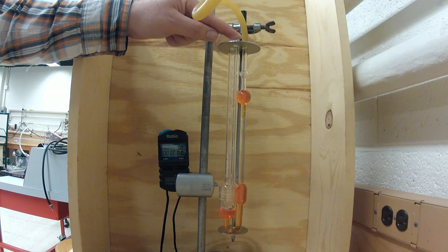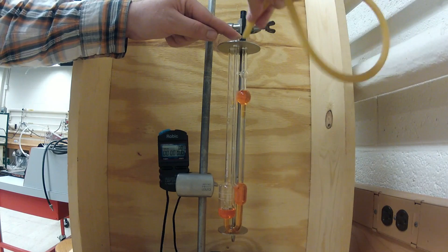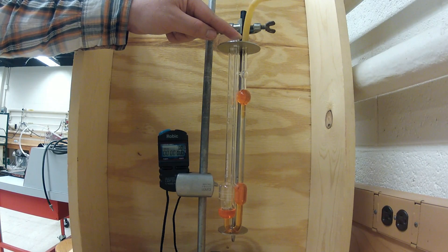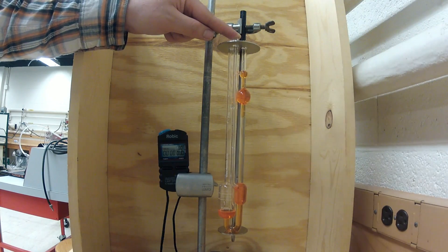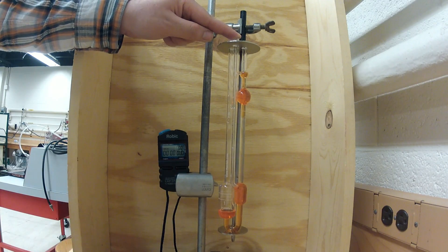It may be helpful to have a lab partner secure the end of the surgical hose onto the viscometer, as it can easily fall off during the experiment. If this does happen and your finger has not come off of tube 3, you can simply take the syringe, depress the piston, and reattach the hose to the end of the viscometer as shown here, and continue.